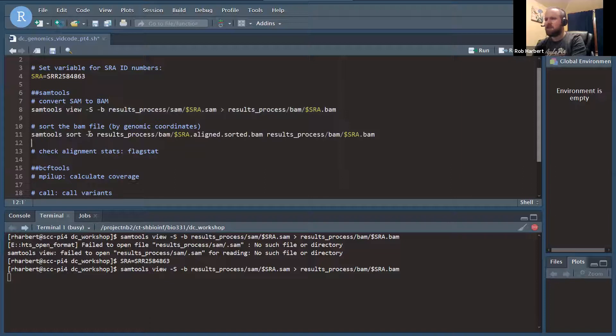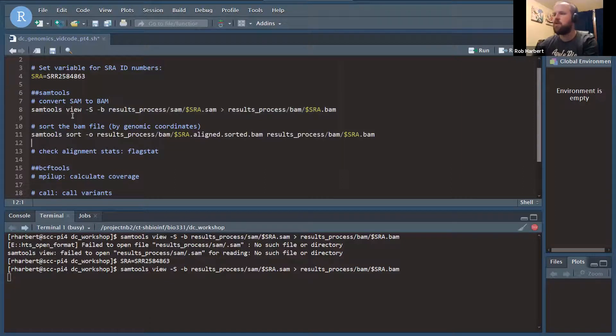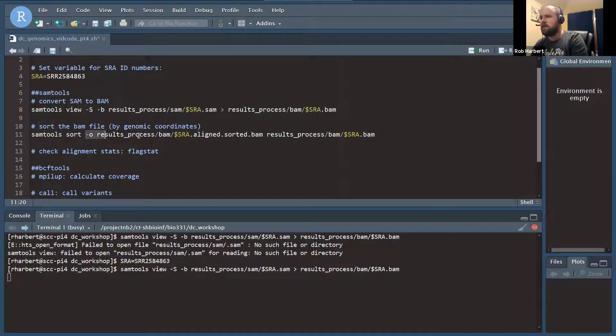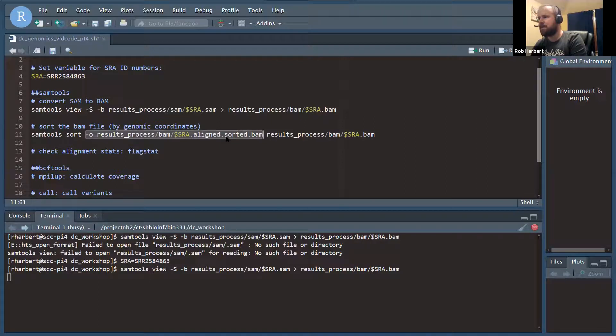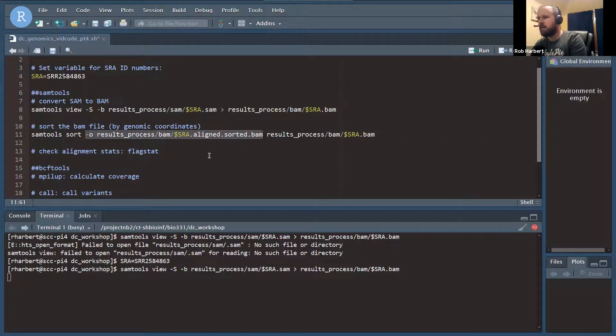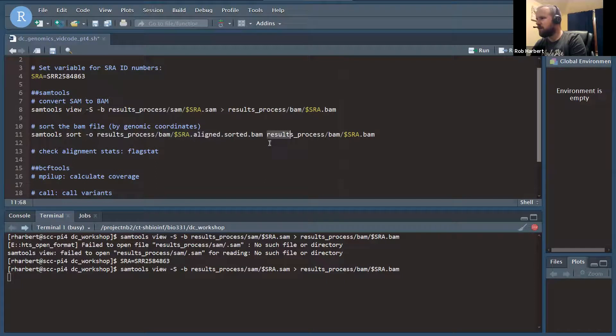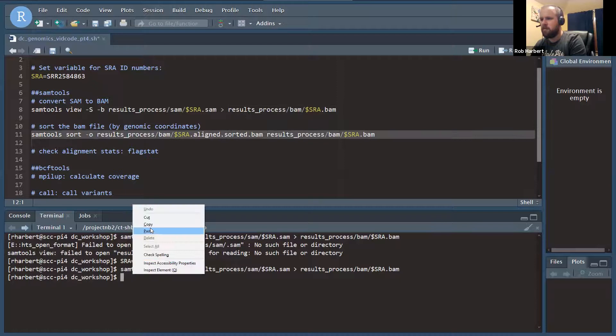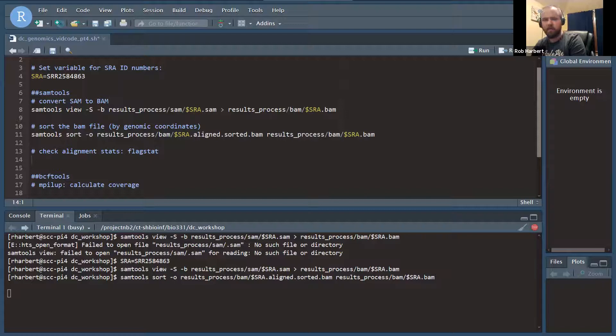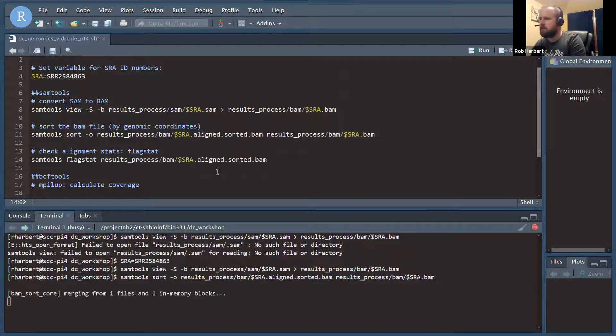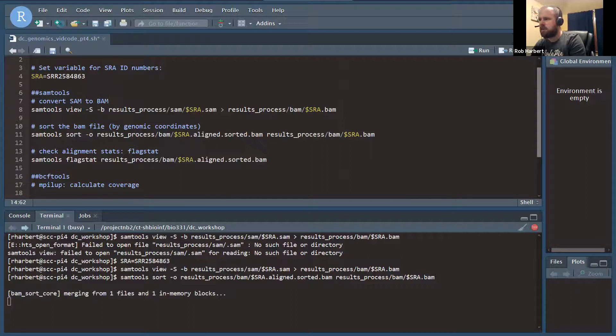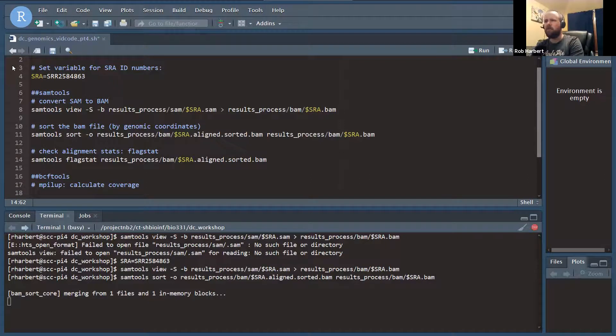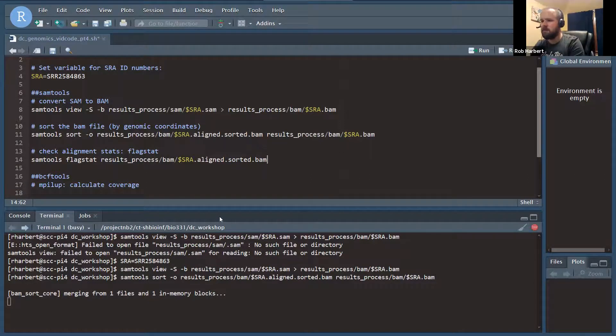When that finishes, we're going to move on to our sorting. We're going to use SAM tools sort, defining an output file which we're going to call the SRA number dot aligned dot sorted dot BAM. That way, we know a little bit about what's in there and can hopefully keep track better than overwriting SRA dot BAM. While that's going, I'm going to go ahead and set up our flagstat command. This doesn't do anything to the BAM file, but it is going to give us some stats about the BAM files, gives us a chance to check out how well we've done.